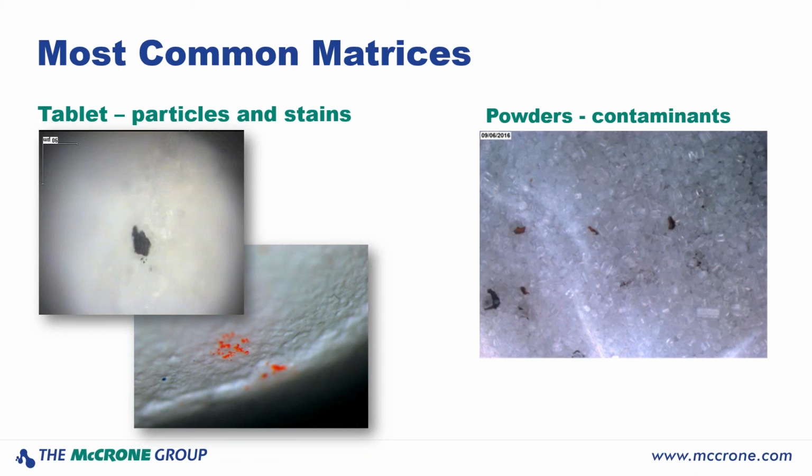And for a powder like the one you can see on your screen with these nice big clean crystalline morphology, not a lot of that is going to go with our particles, and we'll be able to manually and physically isolate those. So we don't have to worry too much about the matrix in that case. When we get into the finer powders and the tablets and the capsules, now we do have to be a lot more concerned about our matrix.